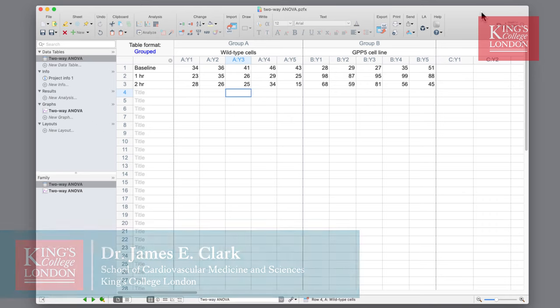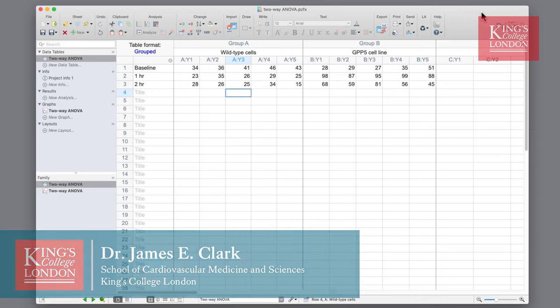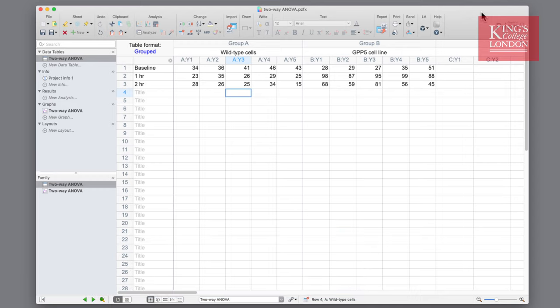Hello, I'm James Clarke from King's College London and in this short video I'm going to show you the steps required to undertake a two-way ANOVA analysis in GraphPad Prism.